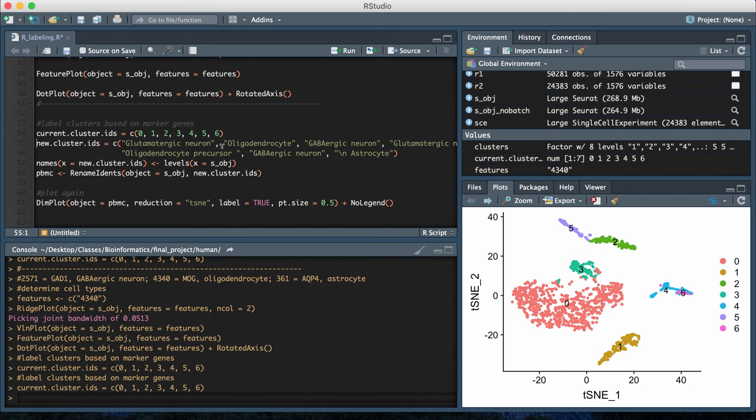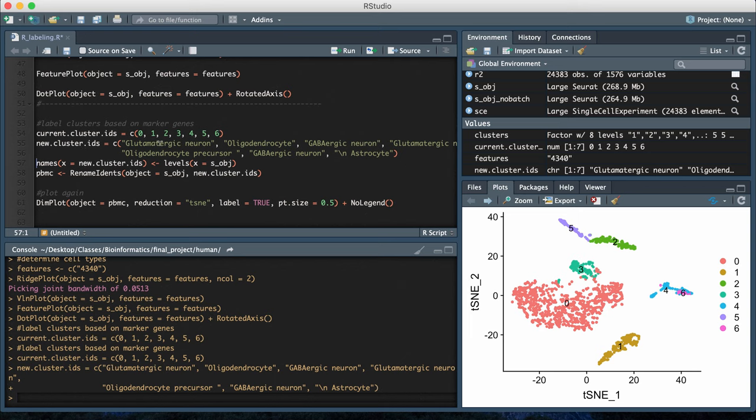The next vector that I have in the code is what I want my cell type labels to be for each cluster, and so this is going to be a vector that has the same size as the current cluster IDs.